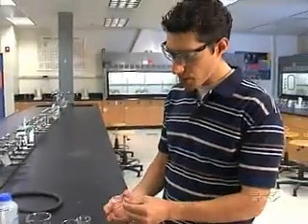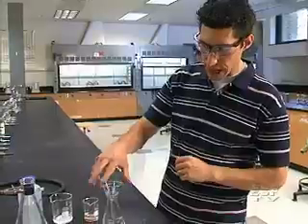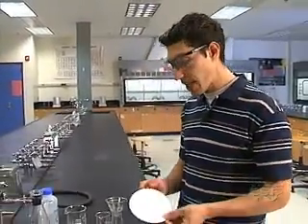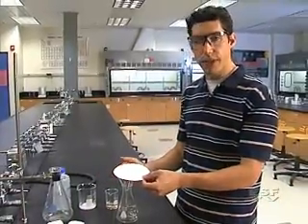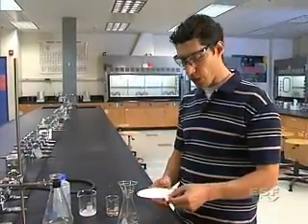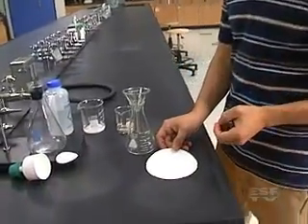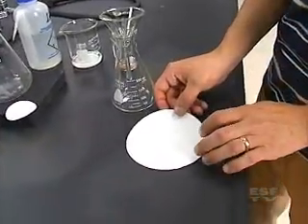I'm just going to put the funnel into the flask and now I need to get my filter paper which is going to filter our solid from our liquid into the funnel, and of course right now it doesn't fit. What we have to do is fold the filter paper and we're also going to flute it. In the process of fluting we're going to increase the surface area so the filtration is that much more efficient.